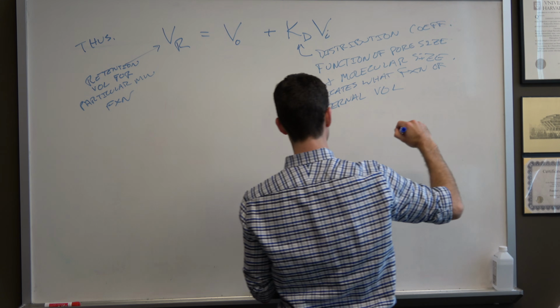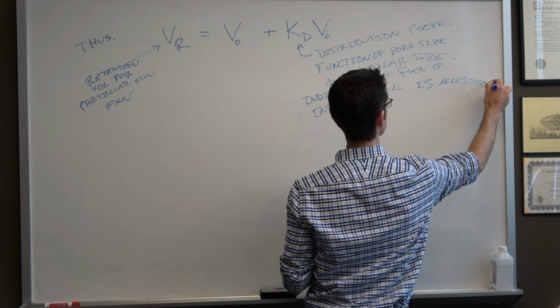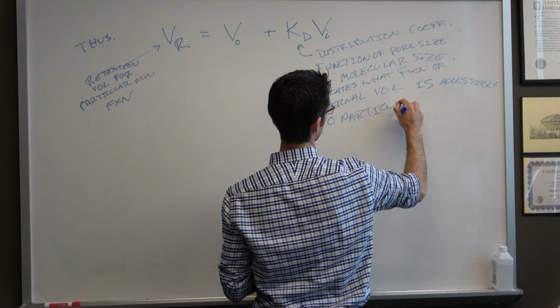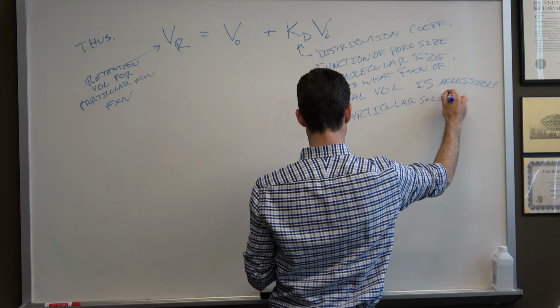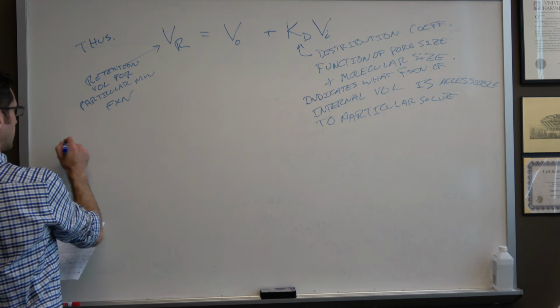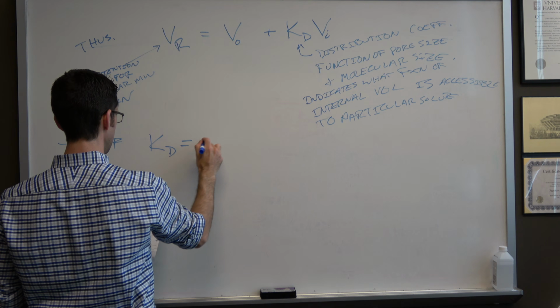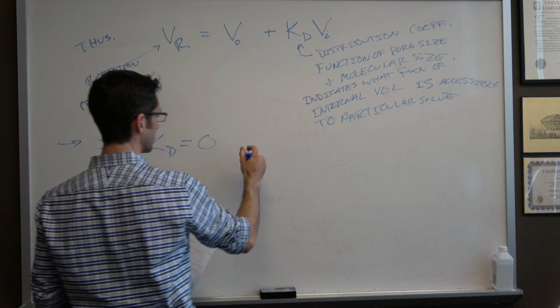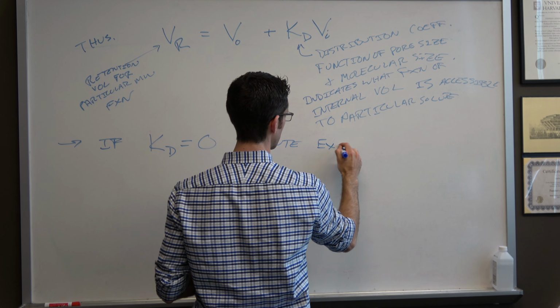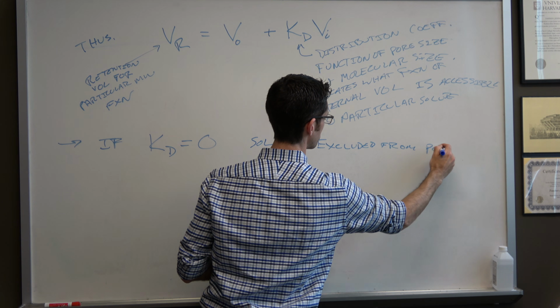Internal volume V sub I is accessible to a particular solute. And the consequence is, if Kd equals zero, then the solute is excluded from the pores.